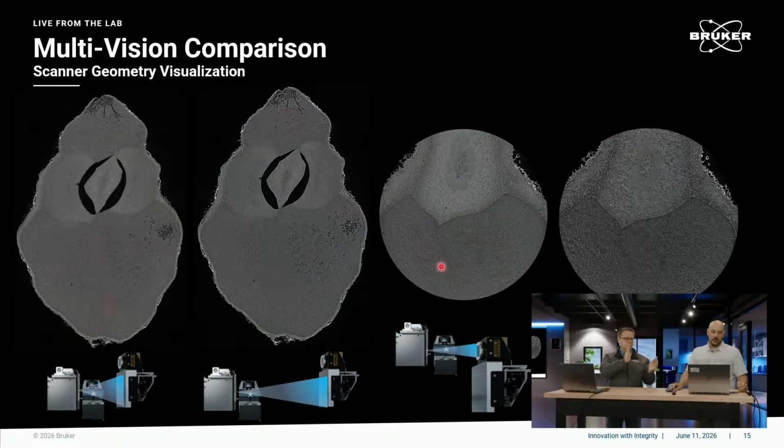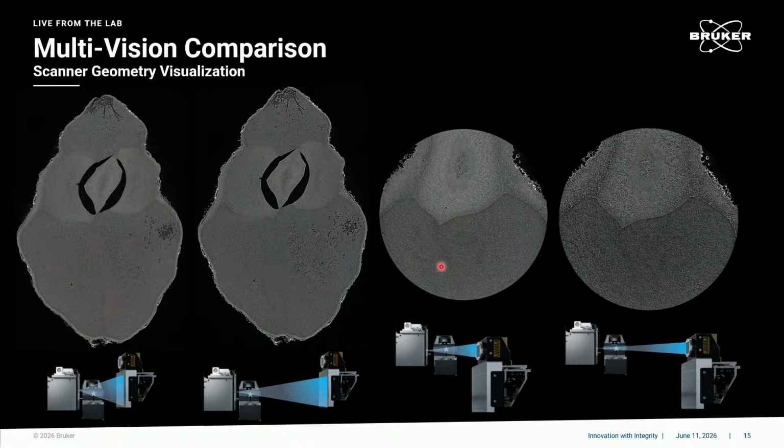All right. So we've got an idea about your general rules of thumb as it comes to power. What about distance? Because now we can, like you said, move the detector. So that gives us that new thing. We can move everything closer or everything farther. It can make things faster, make things slower. Right. How do you approach that? What do you think?